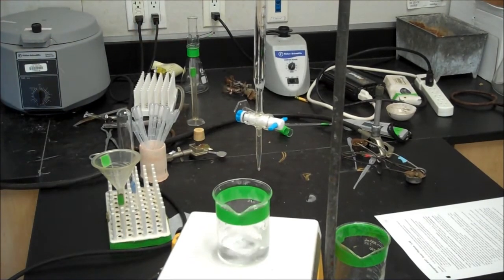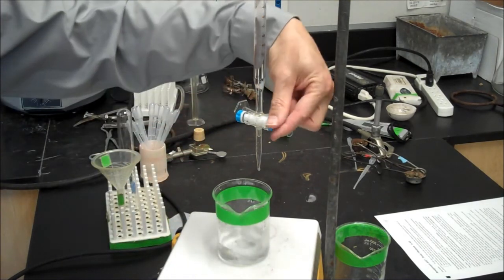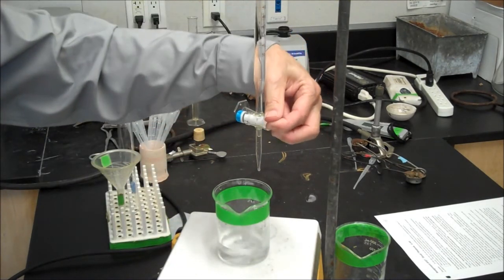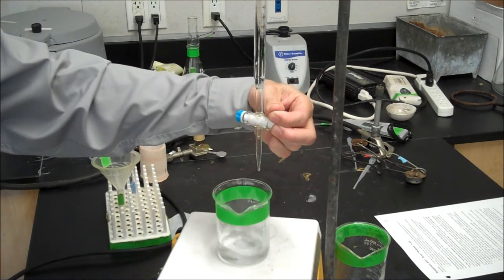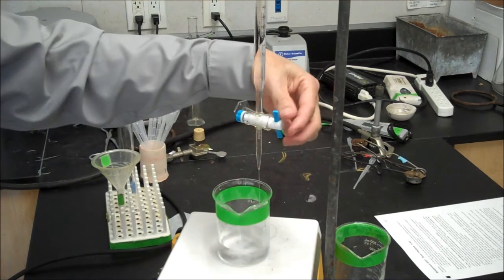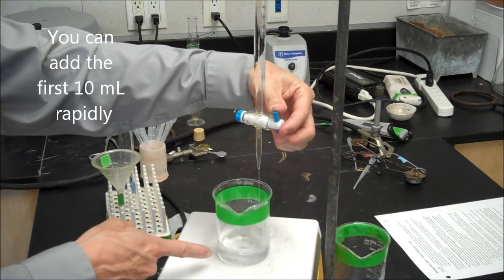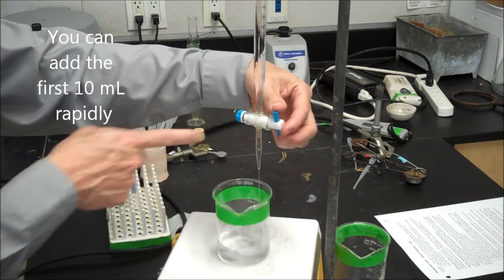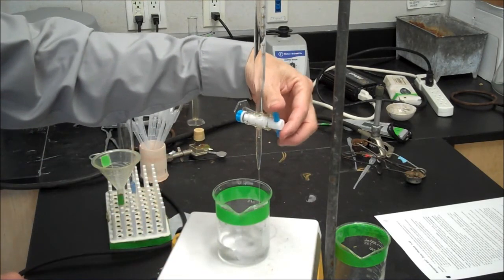The actual act of titrating works this way. My acid is here with the phenolphthalein. My base is in the burette. I can open the valve. I can add the base slowly or quickly. In the beginning of the titration, it's okay to go pretty quickly. What I'm looking for is the amount of base it takes to turn this solution pink. It's got to stay pink.